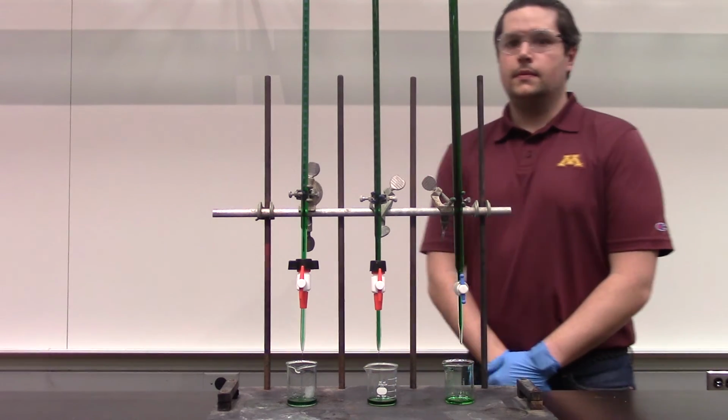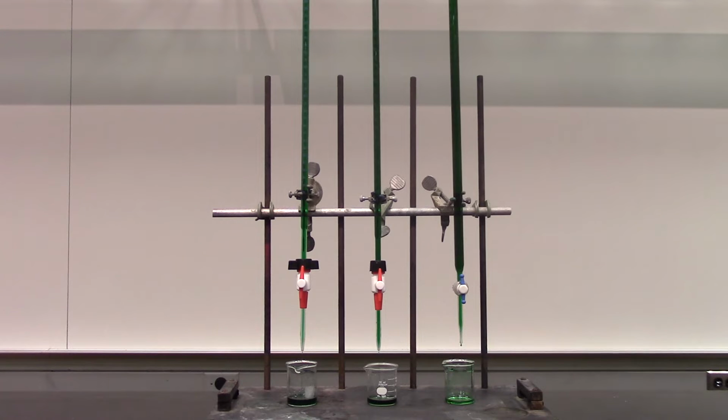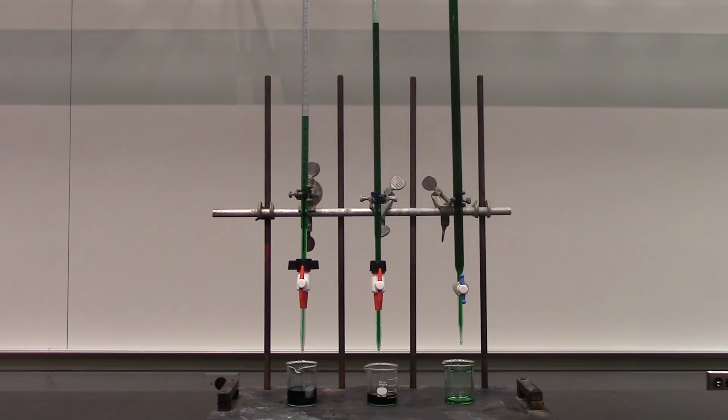As the solutions start to drain, there's a steady stream of methanol and ethylene glycol leaving the burettes, while glycerin is only draining at a rate of about 1 drop every 2 or 3 seconds. As the top of the liquids in the burette begin to enter the frame, we see that indeed methanol is draining the most quickly, followed by ethylene glycol, and glycerin is barely draining at all.